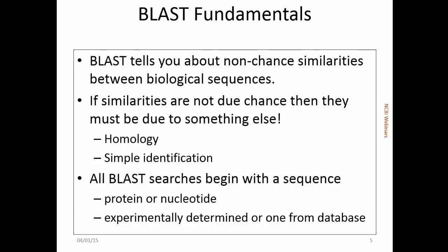Probably the most common use of BLAST, however, is just simple identification. Does this sequence exist in the database? In order to use BLAST, you have to have a sequence, either a protein sequence or a nucleotide sequence. It could be one that you determined yourself, or it could be one that you've taken from the NCBI databases.